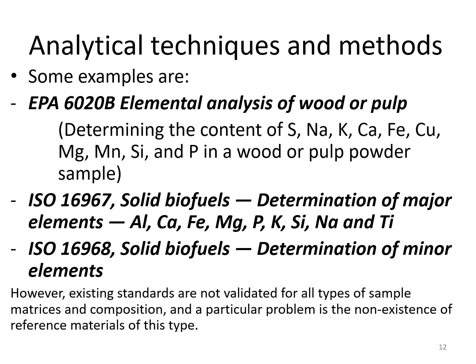So actually these written documents are something that you can buy and apply in your laboratory, and you already have some guidance on how to validate your method, how to calibrate your instrumentation, how to test the quality of your results, and so on. The problem remains that these already existing documents are not sufficient in terms of different matrices in which you can analyze, for example, elements in solid biofuels. So they are only tested on a limited number of different matrices.